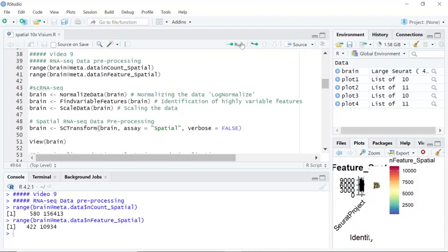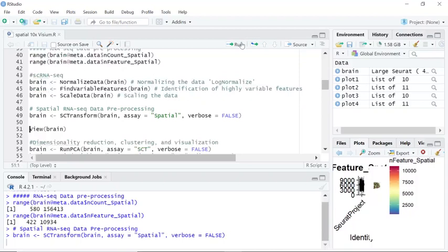So let's run this function. Because it performs three steps at the same time, it takes a little time to run.